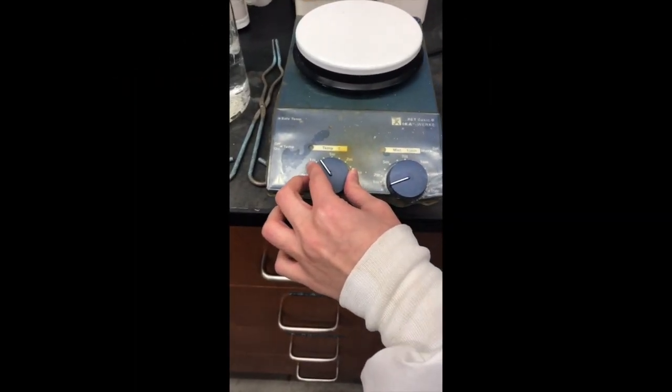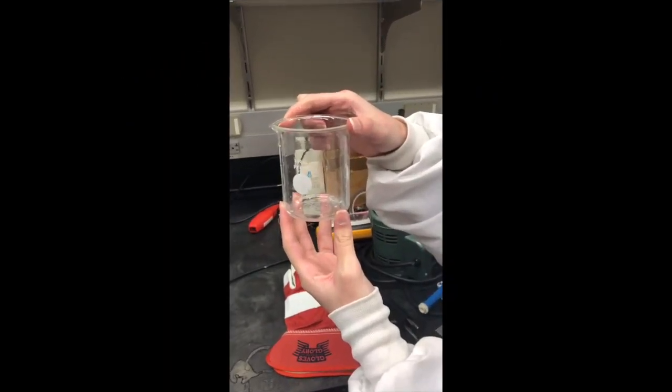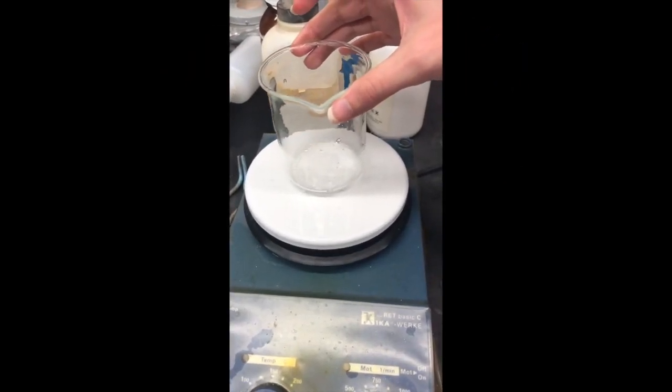For liquids including water, it's a good idea to use either the medium or medium-high setting. Make sure you're using unbroken Pyrex glassware. Make sure the base of your glassware is not bigger than the base of the hot plate.